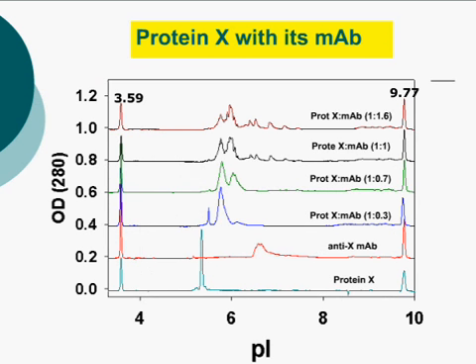And we also performed a similar binding study with our recombinant protein, the same recombinant protein that I discussed earlier. This figure shows the binding of the monoclonal antibody that targets this protein. And upon titrating the product with its specific monoclonal antibody, you'll notice that the electropherograms begin to change, and they do stop changing about a 1-to-1 mole ratio.